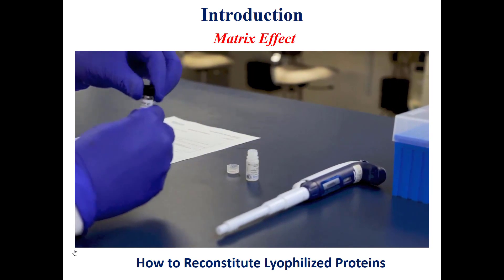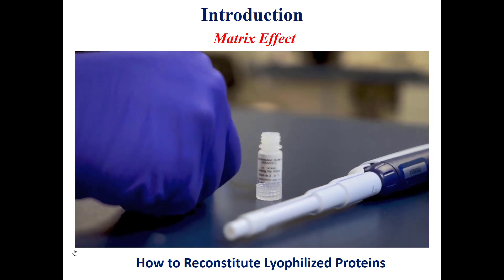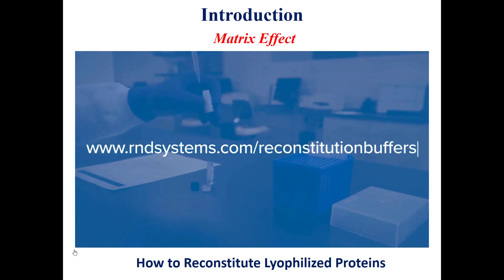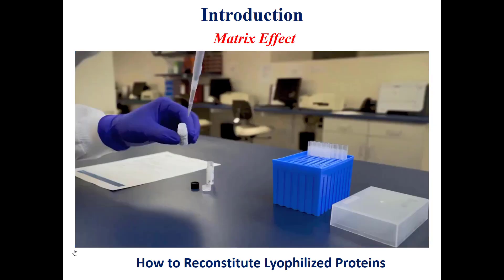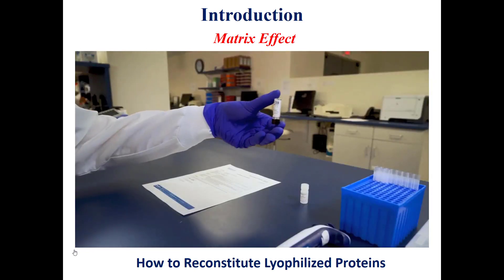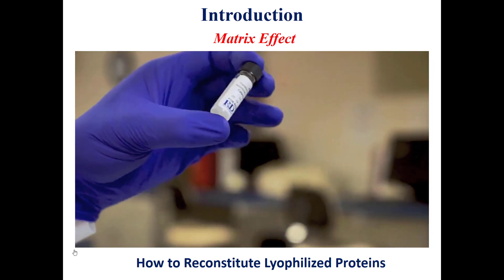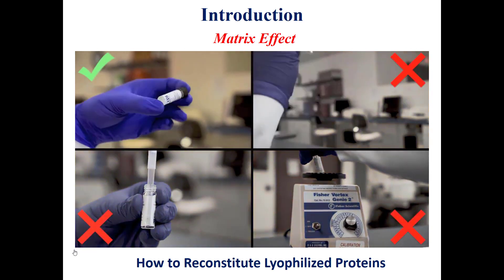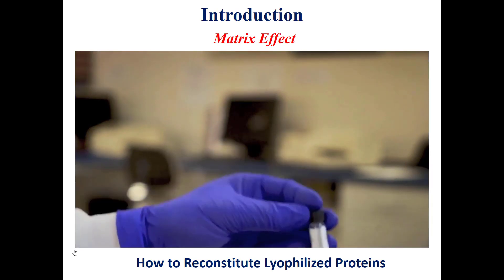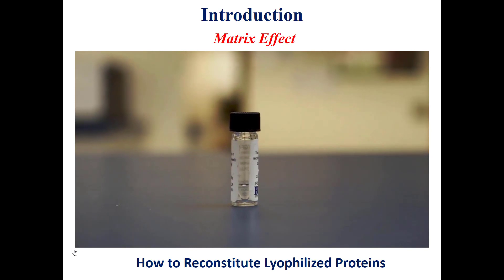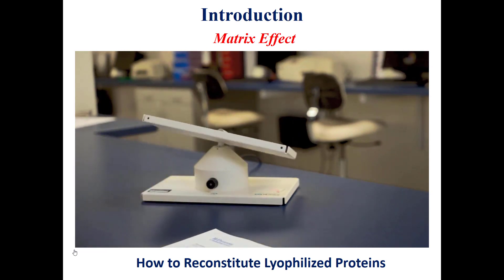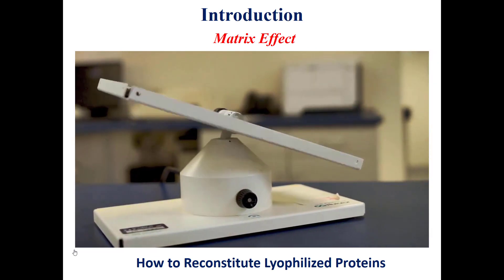Now you are ready to add the buffer. If you do not have the necessary buffer on hand, RND Systems offers a ready-to-use buffer specific to your protein or antibody at www.rndsystems.com/reconstitution-buffers. Using the volume calculated with the reconstitution calculator, slowly add the buffer to the vial to achieve the desired concentration. Gently agitate the vial to ensure thorough reconstitution. When mixing, avoid shaking, pipetting, and vortexing, as this can result in protein loss or denaturation. The powder should be entirely dissolved within 15 to 30 minutes.